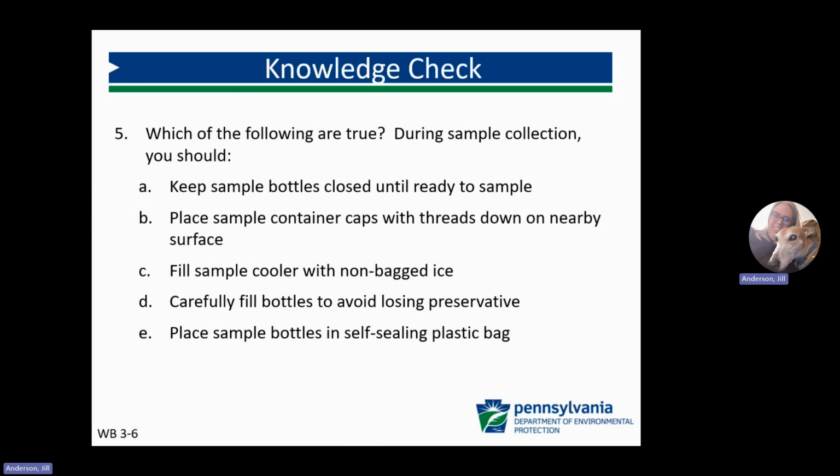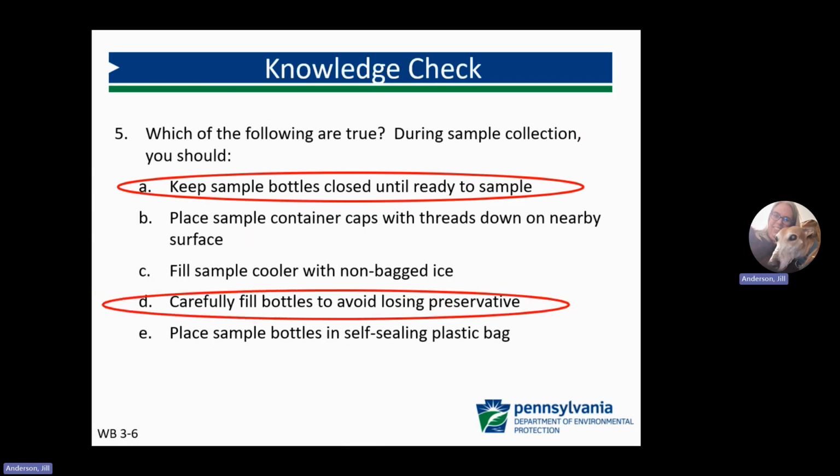Question 5. Which of the following are true? During sample collection, you should do what? And the correct answer is A, D, and E. Keep sample bottles closed until ready to sample. Carefully fill bottles to avoid losing preservative. And place sample bottles in a self-sealing plastic bag.